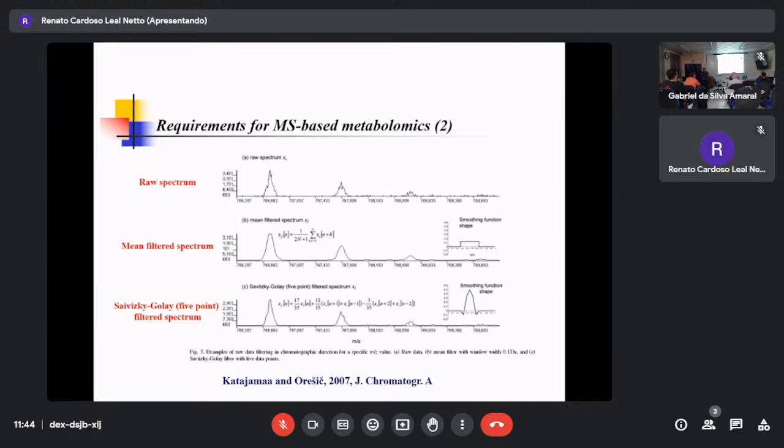Now I don't want to explain the algorithm, because algorithm means you can use any kind of algorithm. But the question now, original data is this one, which means there are two possibilities. Because of HPLC, and because of mass issue, this one is like one picture like this one. Another possibility: probably all these peaks might be different.